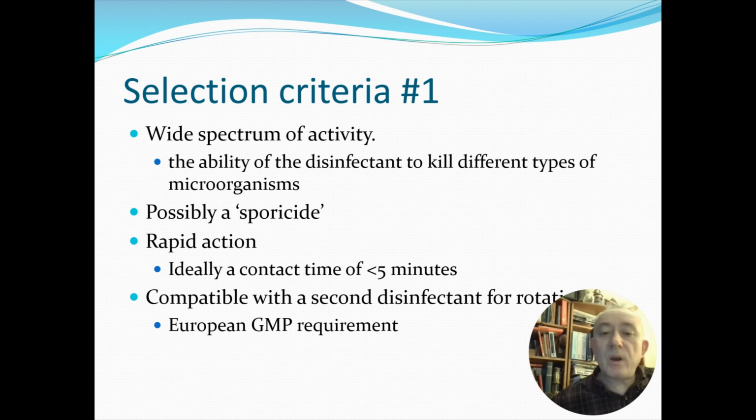And where we're using two different disinfectants in rotation, as is a firm requirement under European good manufacturing practices, we need to make sure that the two disinfectants are compatible. So again, although we're seeking low to zero residues, we don't want the residue of one disinfectant interfering with another.